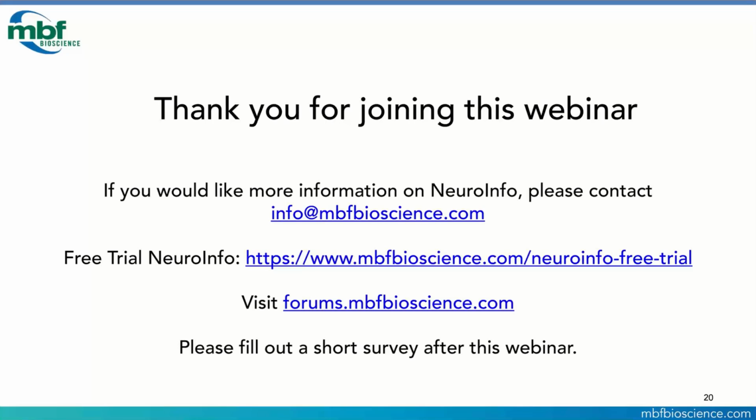And Chip, toward that, I just throw in there the output of this, because another person has a very similar question. We make available upon request and are publishing our XML format for all of our measurement storage. So you can actually get in there in Python or MATLAB and get at all those coordinates as well, like you were saying. But we have a standardized format for that that's freely available to folks. Right. Well, it also just comes out in an Excel spreadsheet. That's right. That's straightforward.